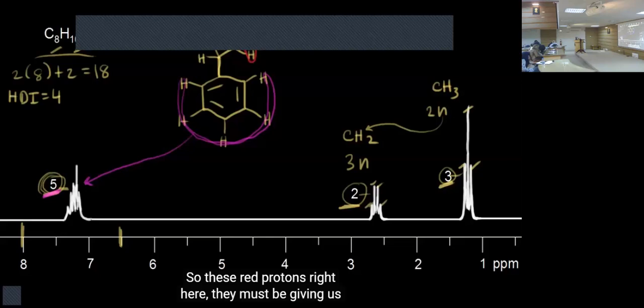Okay, can we move further, Hani? How do we directly go to it? Directly go means, see the first example, the previous one. After seeing the peaks, we have 2 peaks. For example, just consider you do not know the structure and you have this simplest spectrum in front of you.